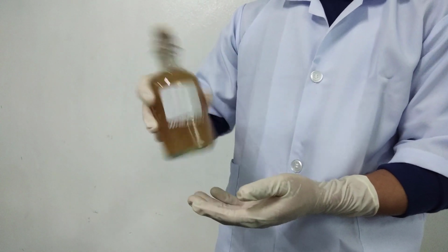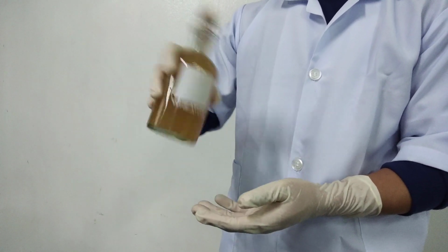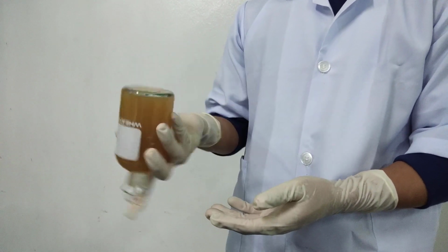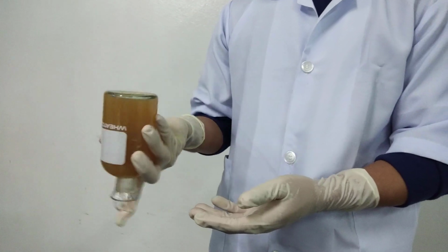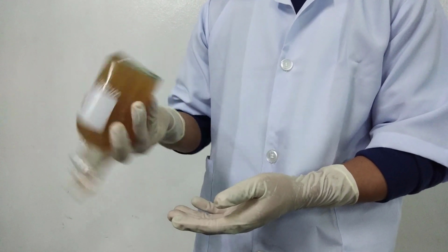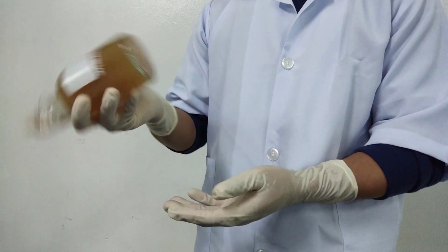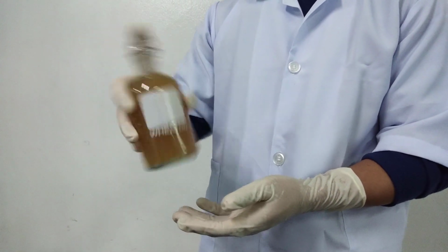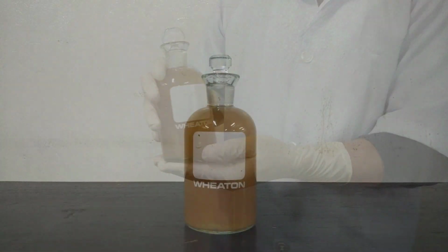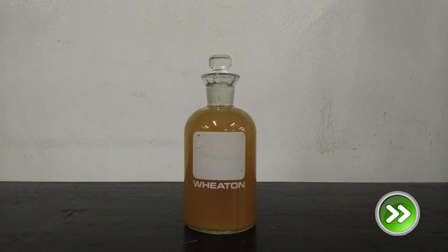We can do this for about 20 times. After inverting the bottles several times, we will allow the precipitate to settle.